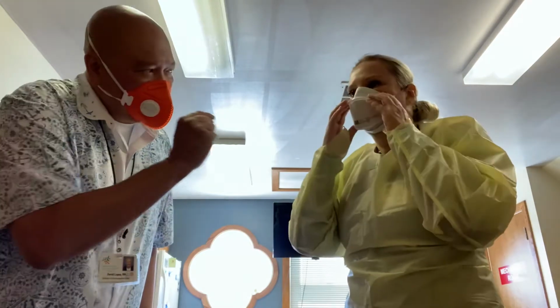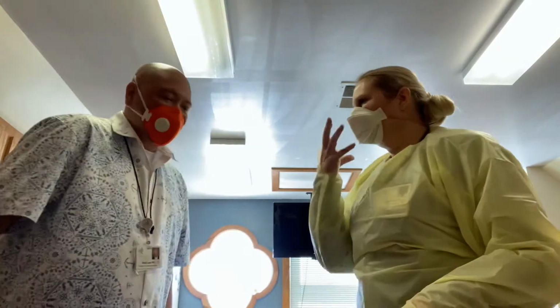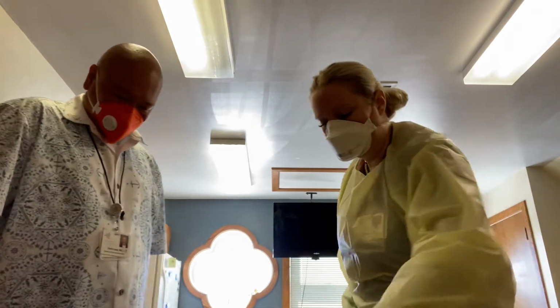This is where it's most important. You need to make sure you're fit checking your N95. You see how it formulates? Hers are a little different than mine, but they're all the same N95s. The most important part is you're fitting it to your face and it seals it. Okay? You're going to feel the air come in and out when you breathe. Yes. Okay. Next that you will do is to put on the hair nets. Okay.